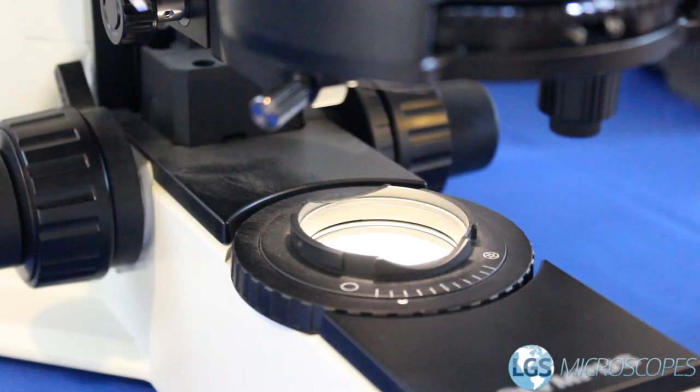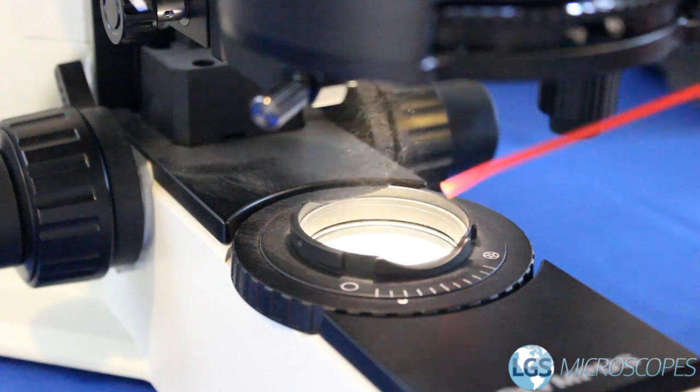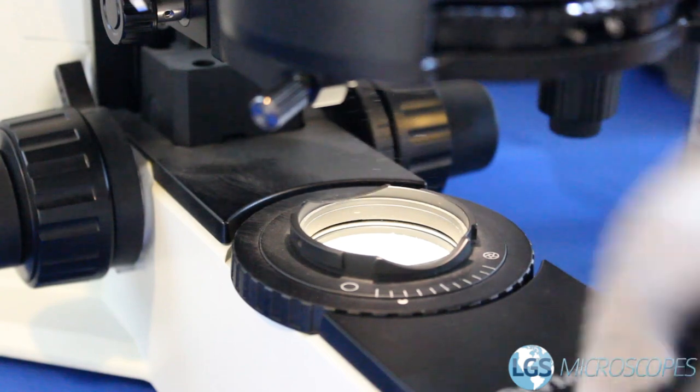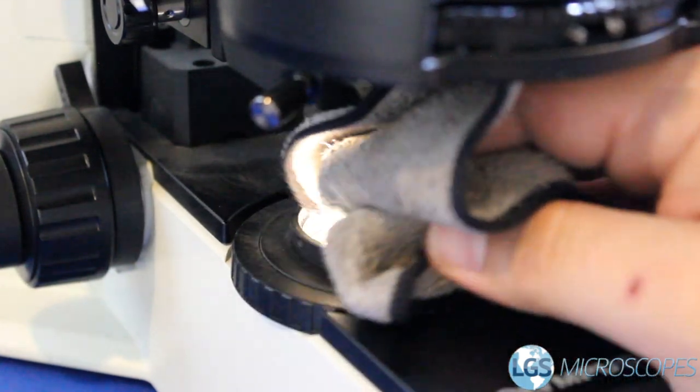Now we're going to move on down to the collector lens, which is the big bright lens on the bottom of the microscope. As you turn the light up you can see that this is a dust magnet. Start by hitting it with some air — shoot out to the side a couple times first, then hit it. Then you can take your microfiber cloth and wipe it off very gently, not applying any pressure, just swirling. It's not uncommon for there to be some dust left over on the collector lens, as there can be dust inside the assembly and underneath. Those things are better left for a professional because if you take it apart you have to make sure you get it back together the right way or your microscope just won't work.